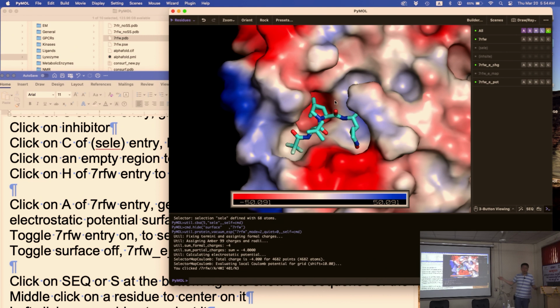So this is probably a more colorful figure. So sometimes we show that as well, the electrostatics, especially shows information that you have a very nice positive charge region that binds nucleic acids, for example. So that gives you a sense of where that is. So this is something that you can use as well for making figures for your paper or for your thesis or for whatever you want to do.